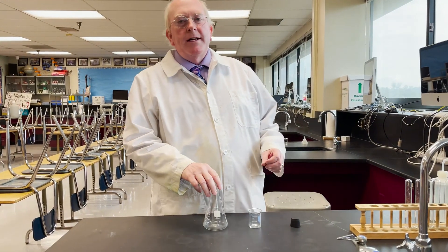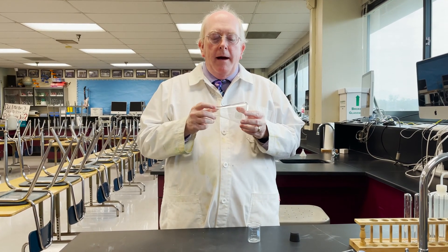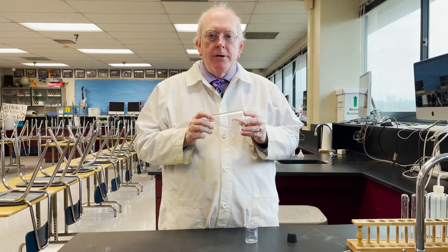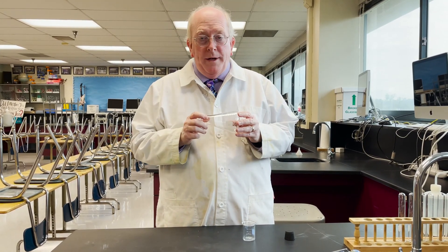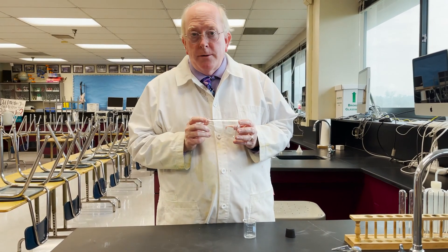Hey everyone, Morgan here. We're going to talk about an interesting piece of glassware today called the Erlenmeyer flask. An Erlenmeyer flask is not designed for measuring — it's designed for holding. We can carry out reactions in them too, especially in a technique called titration.